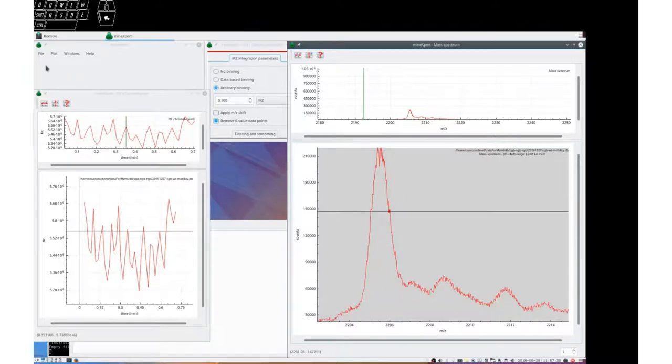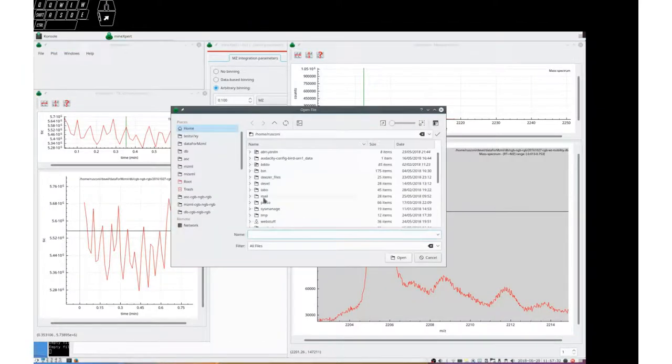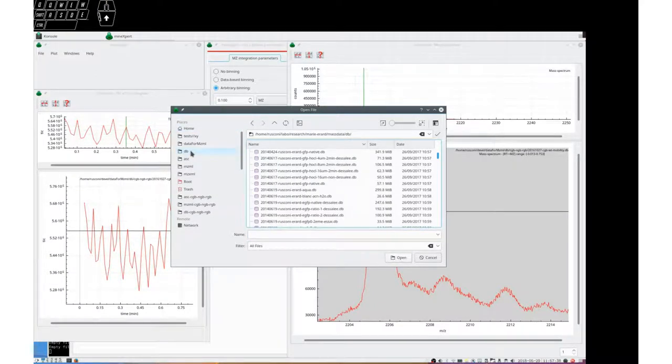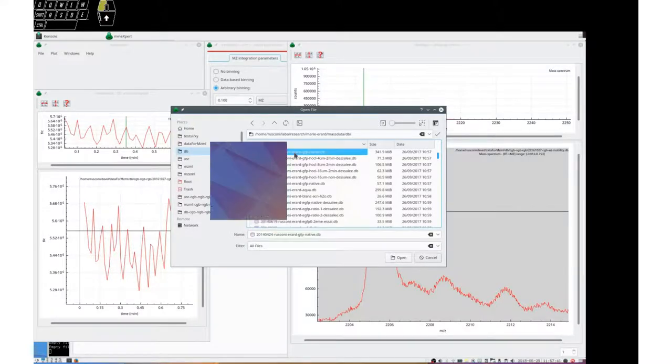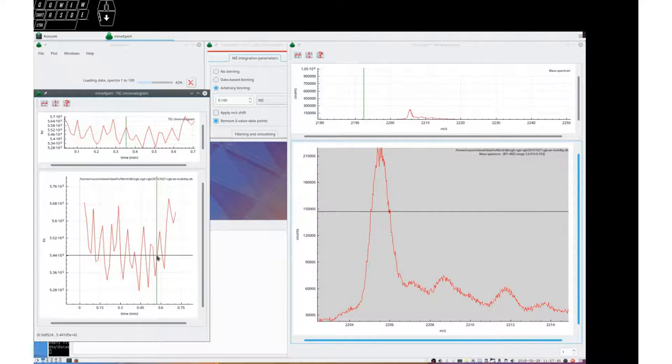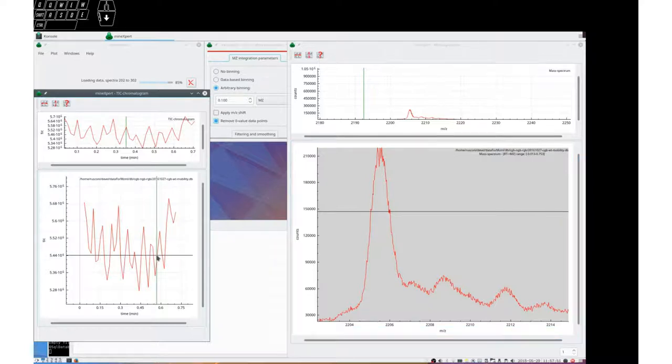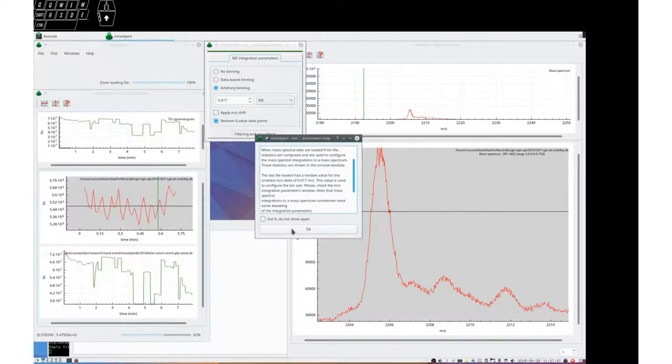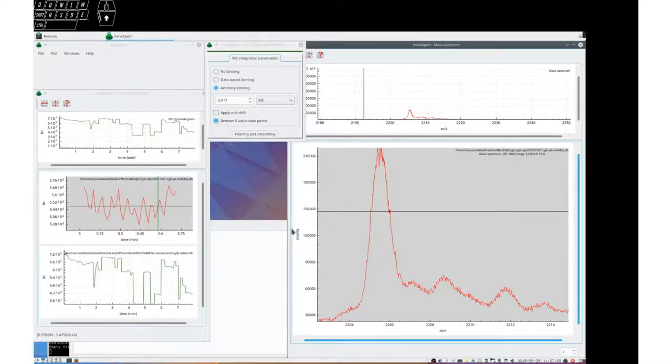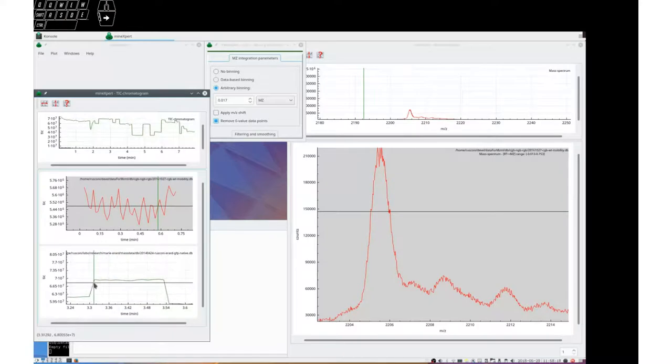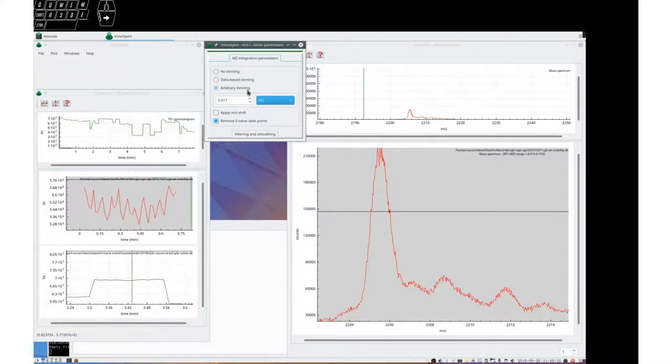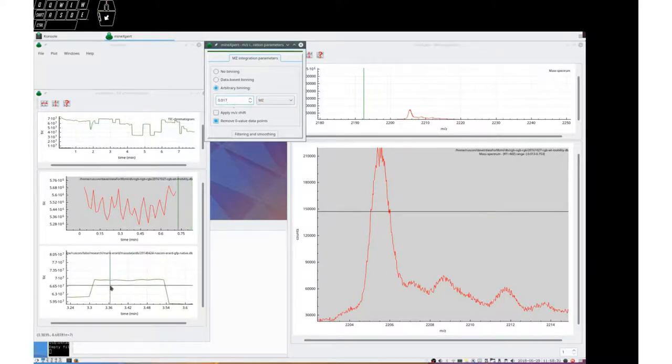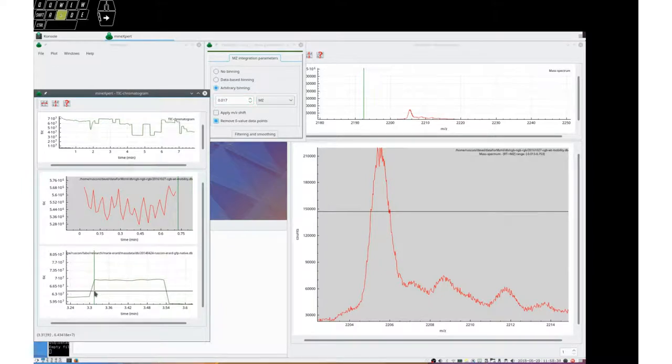Let's open another file that is from a micro QTOF spectrometer from Bruker, and it's about a protein. Let the program integrate the data. And we now have the tick chromatogram. Let's integrate this small region here. We can zoom on it. So start with an arbitrary binning that was configured to be 0.017 MZ values and see what happens.